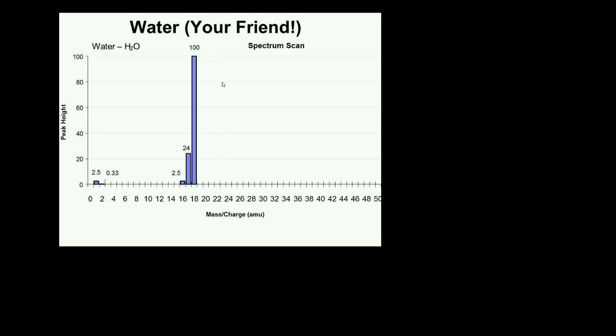So you will actually see an increase in pressure in your chamber due to the release of water. In the case of the UHV system, unless you did a pretty good job also outgassing the RGA, what you might find is that you turn on the RGA the first time, water comes up, and then pretty soon it goes away. All that has happened is that you didn't properly outgas the RGA, the water started outgassing from the ionizer, it went up, and then eventually started to go away again.